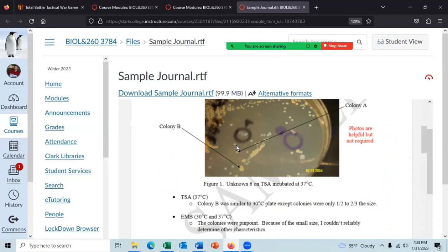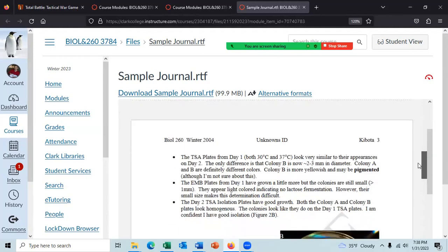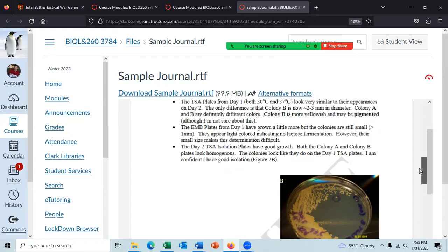So what he did was he streaked out his bacteria. You can see there's 2 different species here. And then he streaked out this colony and maybe that colony, I don't know. And then he grew them up, streaked them out again to make sure he got a pure culture, at least 95% or greater. And then he started doing some characteristics. One of the first characteristics he did was he noted that species B was pigmented. So he got the pigmentation results. He then grew them on EMB plates, and he looked at the growth on EMB. That would be the results.